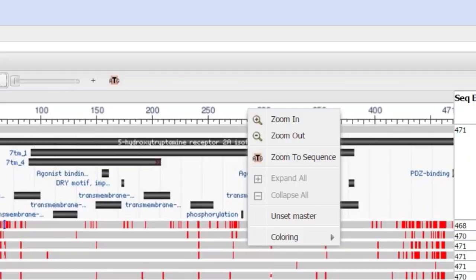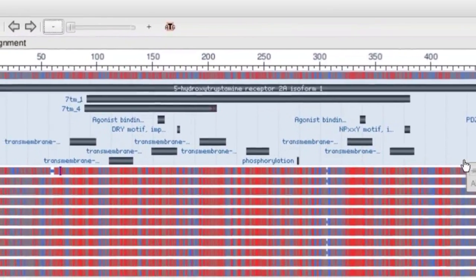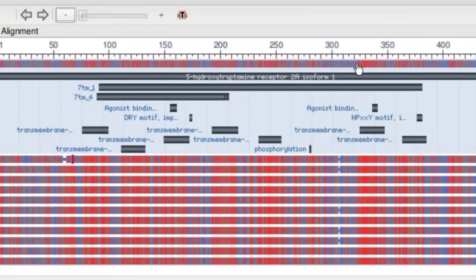In this particular case, we would expect the transmembrane domains to be hydropathic. So we can have this hydropathy scale here. And what that highlights for you is, the redder the residue is, the more hydropathic it is. And you can see that they do a pretty nice job of highlighting the transmembrane domains where those red areas are.